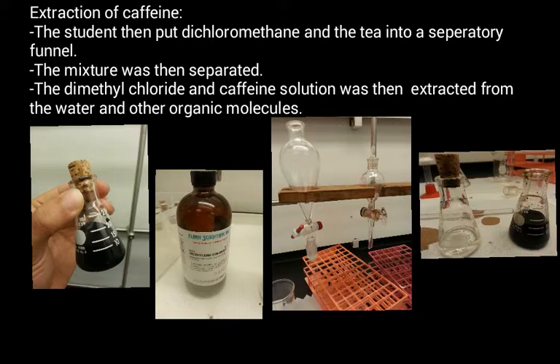The next part of the experiment is the extraction of caffeine. The student then put dichloromethane and the tea into a separatory funnel. He then shook the funnel to make sure all the dichloromethane bonded with the caffeine. Since both are nonpolar and caffeine contains two ketone oxygens, this allows caffeine to bond with the dichloromethane.